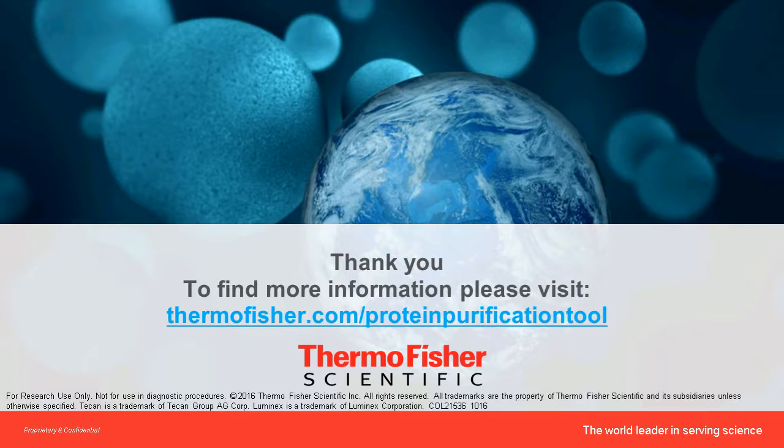So what we do typically is we validate the antibodies using the single-plex IP and protein AG magnetic beads. And we start with 3 microgram of antibody per IP. But when we do the magnetic bead validations, we check individually 1 microgram and 3 microgram of each antibody and make sure whether it is different for each target based on the affinity of the antibody for the target.